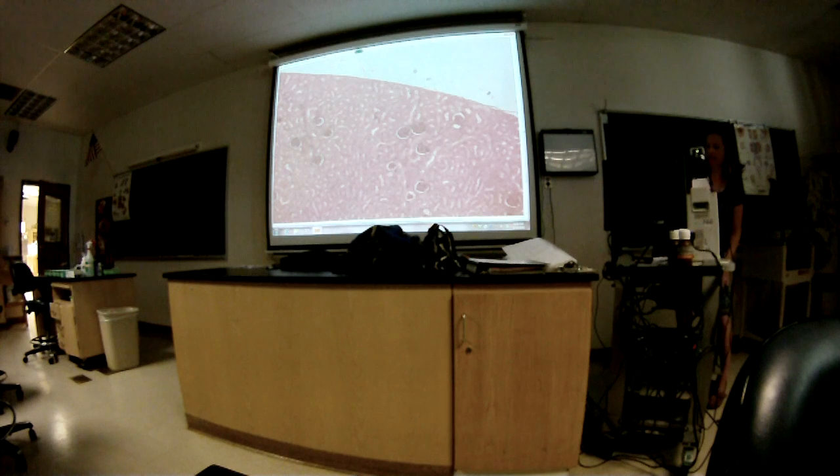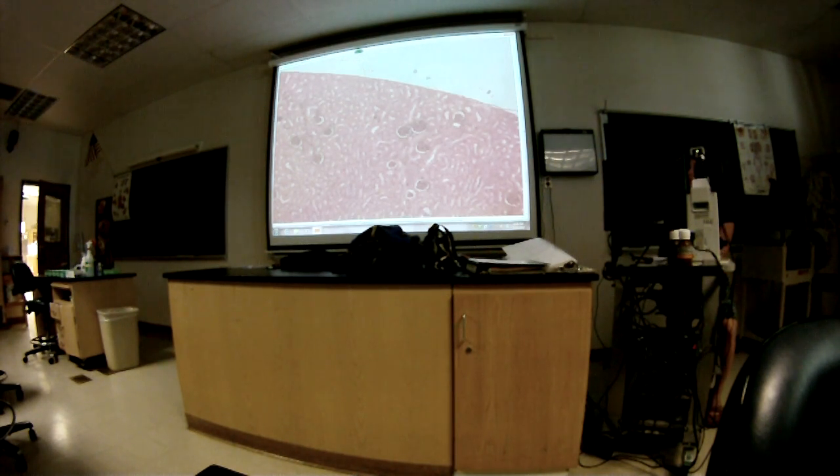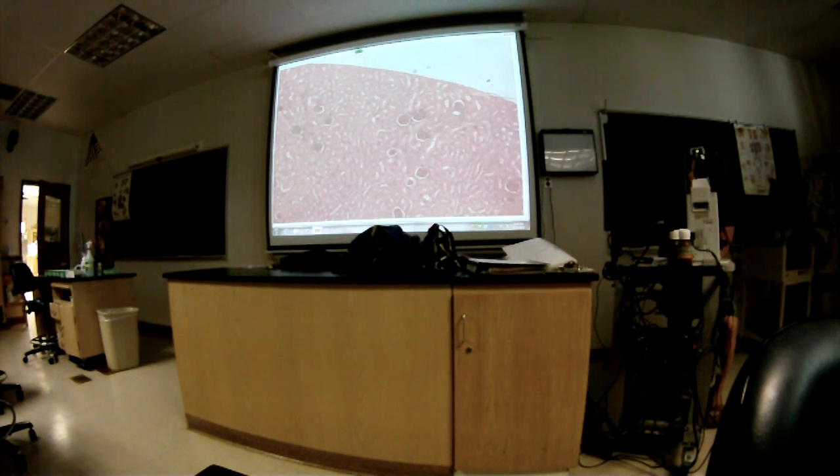Okay, so first, question 1 is name the organ. What organ are you looking at? I will get a little closer if you like and move it around.